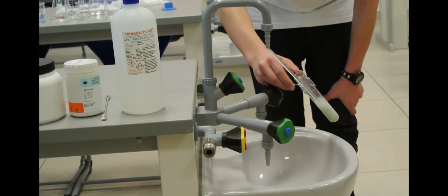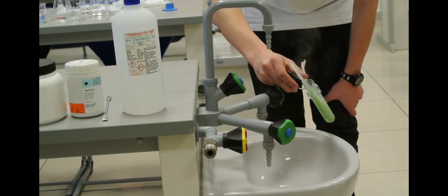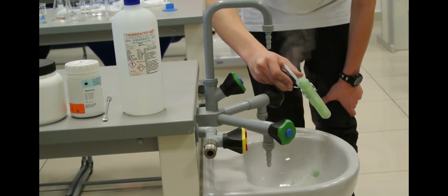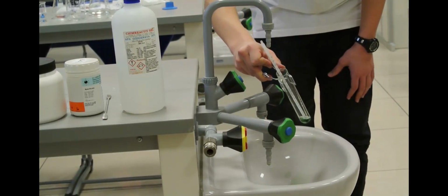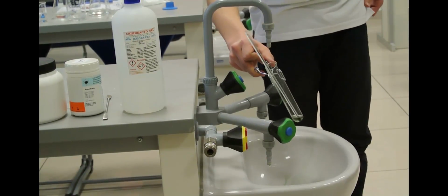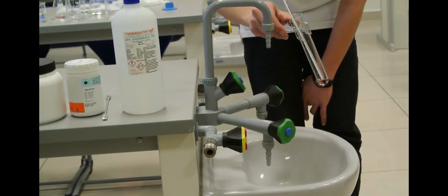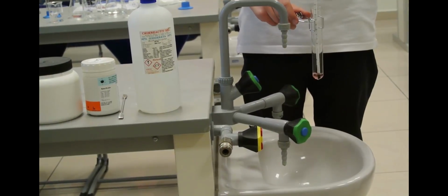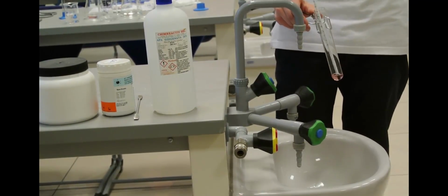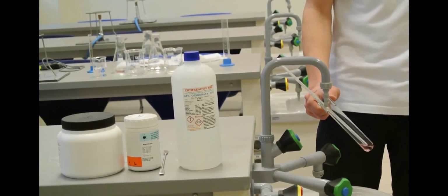Okay, so now we can see that the color has turned green and that it's fizzing really violently. And now that the reaction has stopped, the solution turns back to pink as before, since cobalt chloride is a transition element. And since it is a catalyst, it turns back to its initial color.